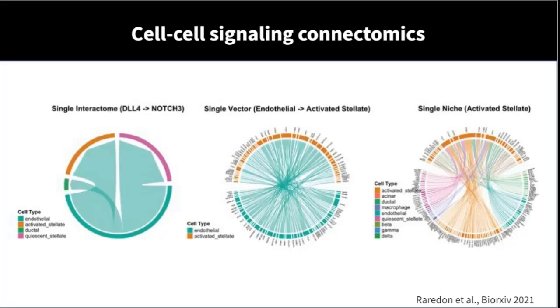This approach doesn't really consider the fact that cell types might never see each other in the tissue. And it doesn't consider that there are spatial constraints to how signals occur. Delta and specifically Notch signaling is a juxtacrine mechanism. If Delta is expressed by cells that are never in proximity to Notch-expressing cells, then those signals cannot really occur.